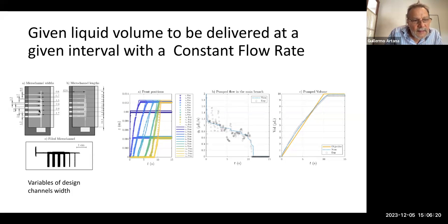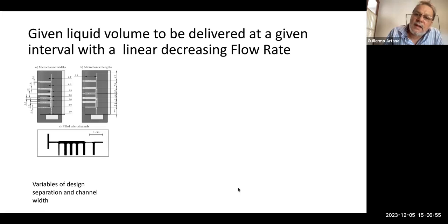So this is the channel configuration that we have adopted, and at the end you obtain different sizes of channels. Here, in dots you have the experimental results, and with the symbols, with the broken line, you have the numerical results, and the same here. So with this system you can predict correctly the volume against time.